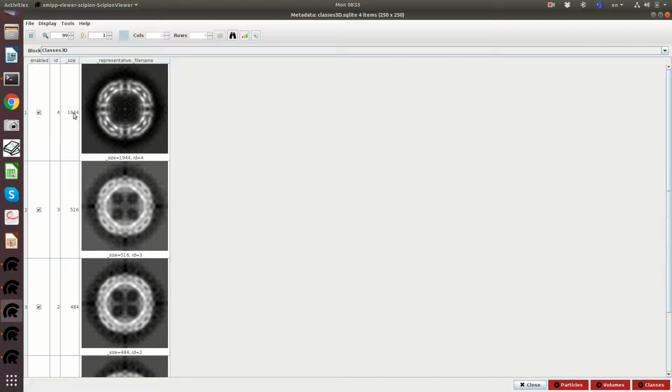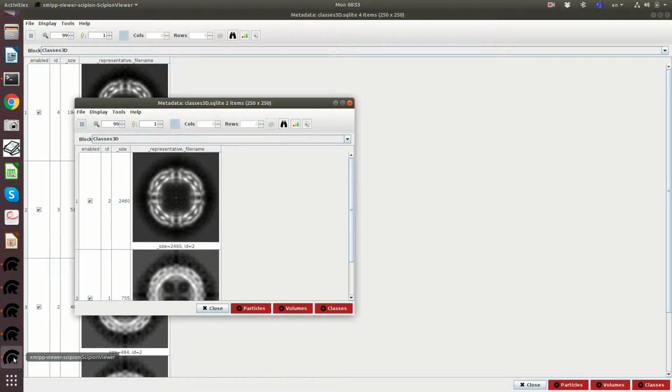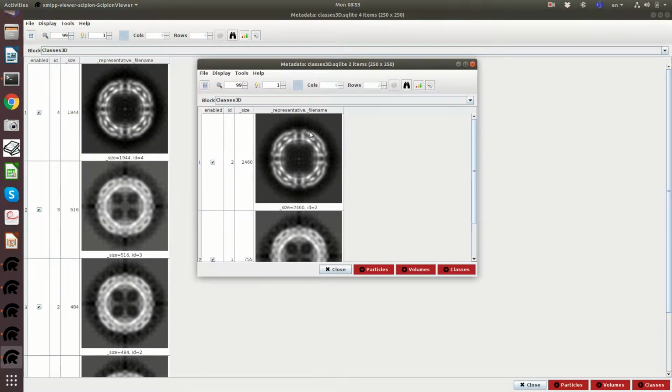Only 2000 particles were consistently assigned to that class. The remaining particles in the original classification, these 400 extra particles, were sent to the wrong class in the other classification. That probably means that those are images for which the class cannot be safely determined. Sometimes a particle is assigned to the good class, sometimes to the bad class, and you are not sure what that particle is.